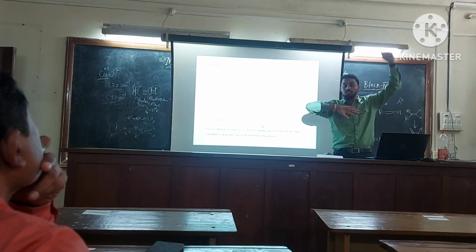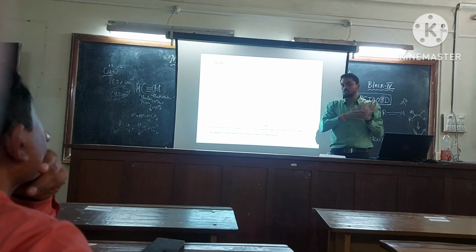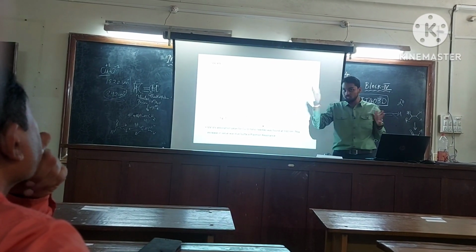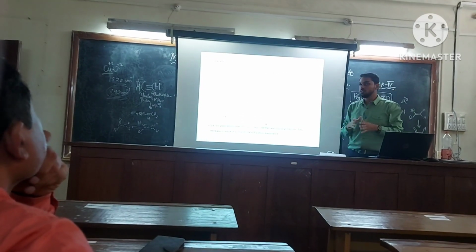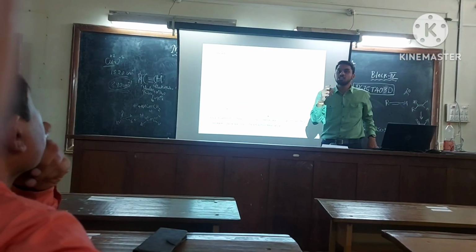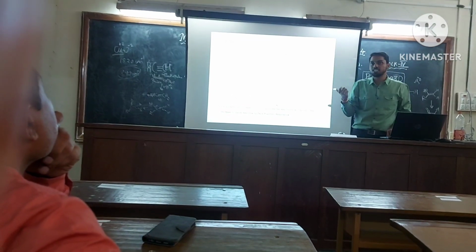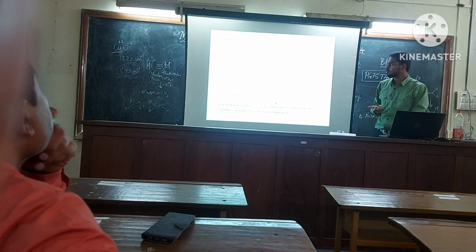There is a drastic change from 330 to 550, an increment of around 200 nanometers. That increase, that red shift, is because of surface plasmon resonance. Whenever light rays hit the metal surface, they set the electrons in oscillation, and because of that there will be an increase in the lambda shift, and the optical properties are also increased.